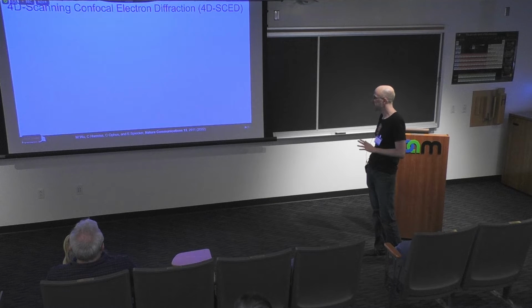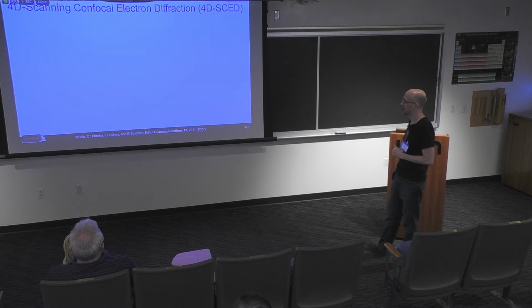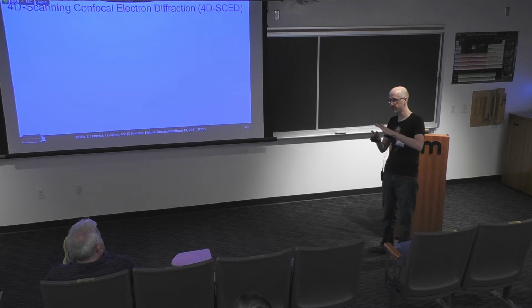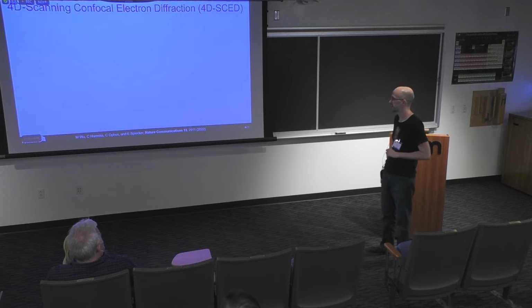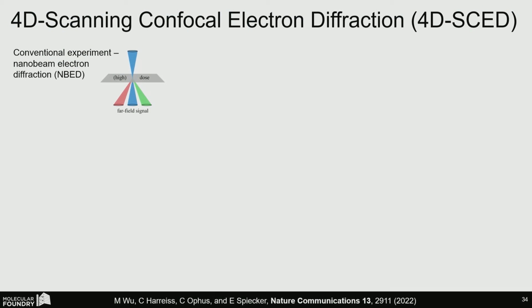Okay, so one last thing I want to mention too about just how flexible the instrument is. This is another German group collaboration here. This is Erdmann Spieker's group at Erlangen. They didn't have our custom apertures, these tiny numerical aperture probes, but they wanted to make the same measurements. And so they came up with a quite creative way of doing this type of experiment.